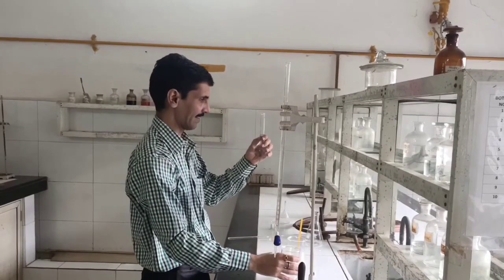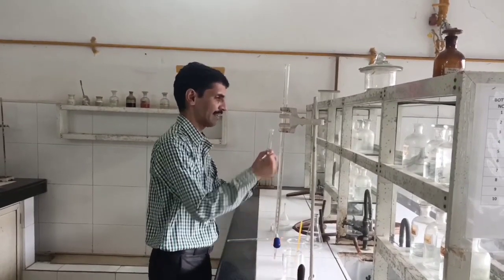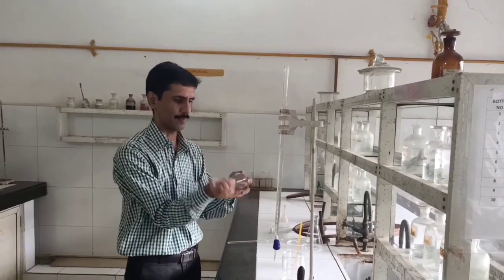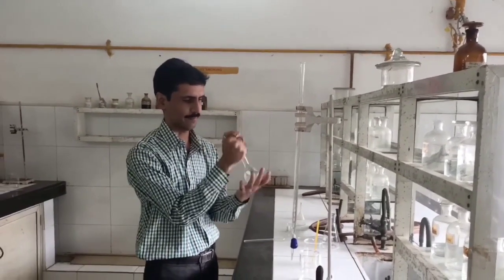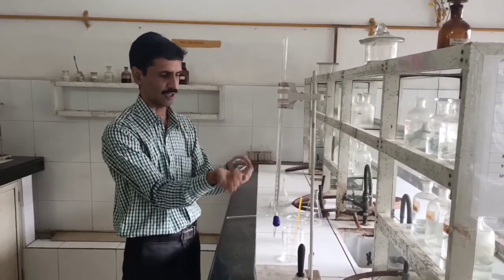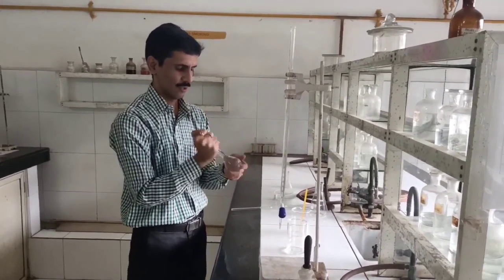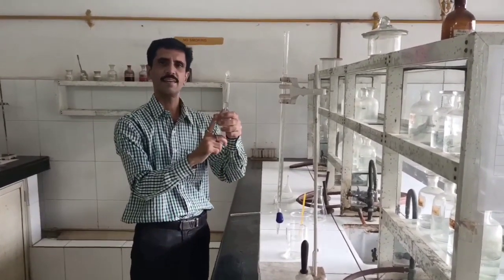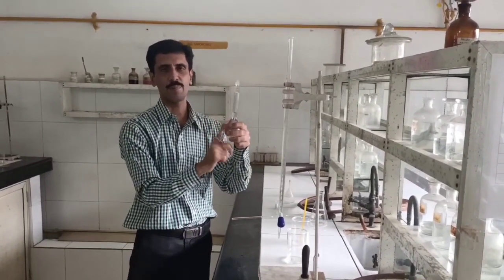Okay, so we are getting it exactly at the mark. If at all it is not possible for you to do it, you can make use of a dropper or a pipette for the final marking. And now we just want to make sure that the solution becomes absolutely homogeneous. So this is it, my dear friends. This is the succinic acid preparation.